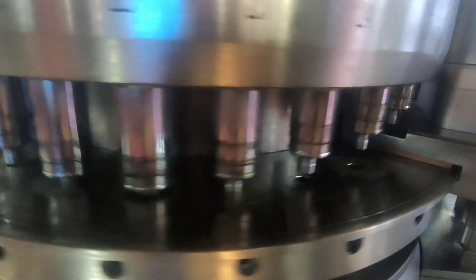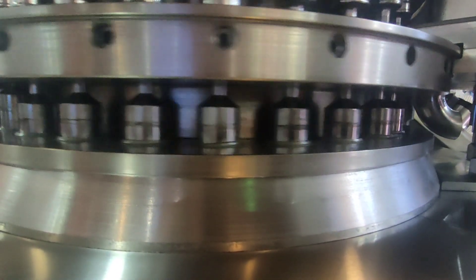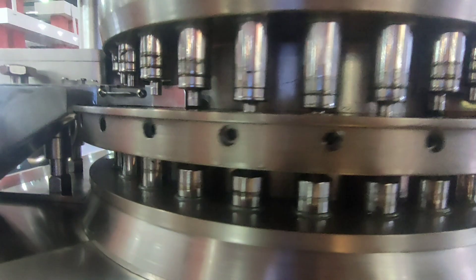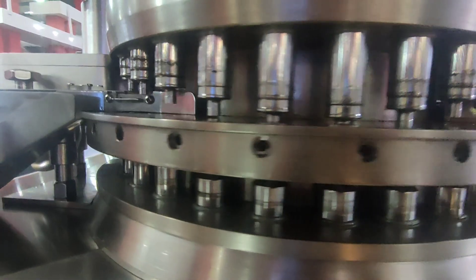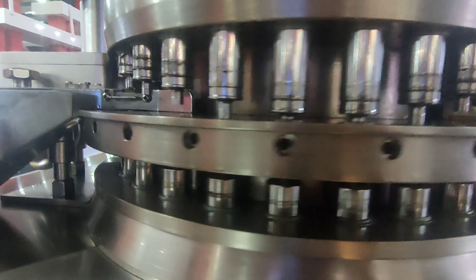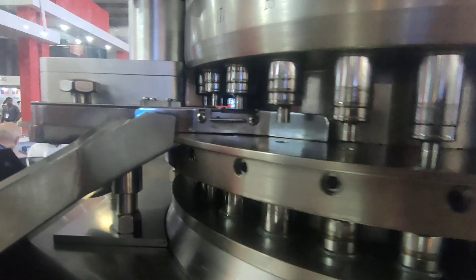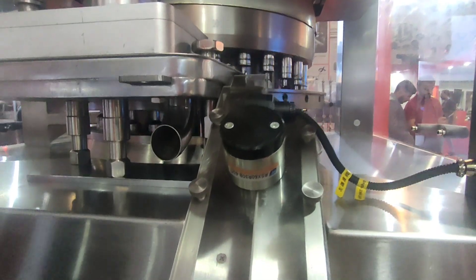You can see in the slow motion that in the third phase, compaction, the upper punch tip comes down into the die cavity and in the same way the lower punch tip comes upward when the upper and lower punch heads pass through the upper and lower pressure wheels. Then the lower punch is slightly pushed upward to eject the tablet from the die cavity.